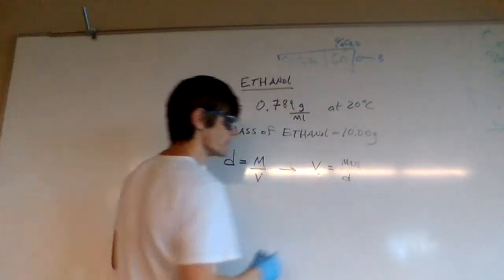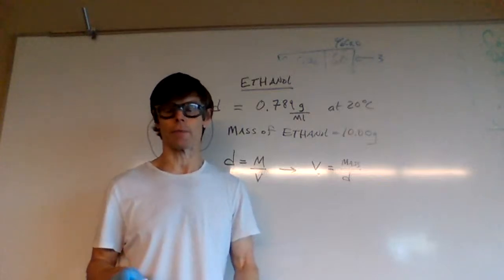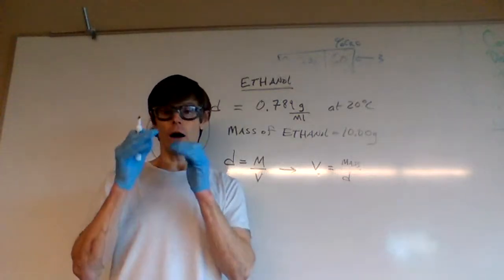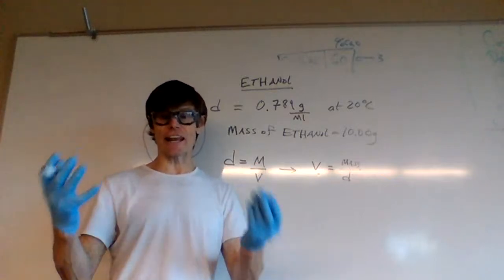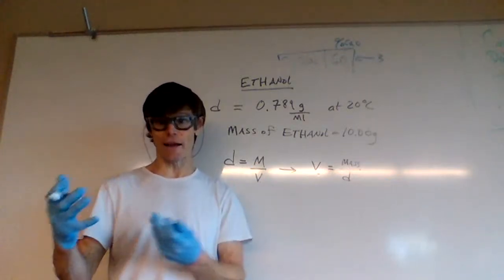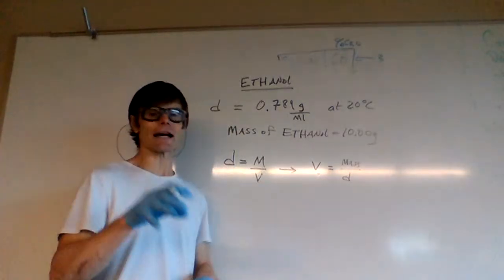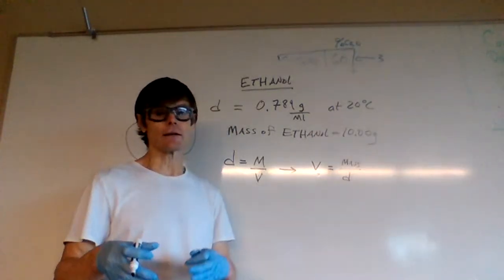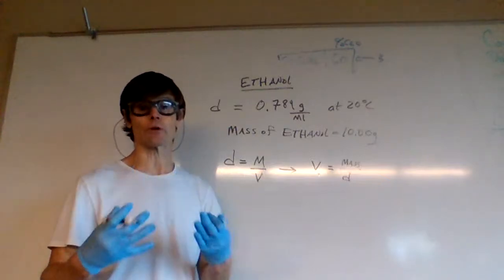over its density. Now, a lot of reagent bottles have density written on them. So we would treat a written amount of density on a bottle as an exact value. It's somewhat like a conversion factor. So if we're using a listed density, it wouldn't limit us in the number of significant figures that we would report.